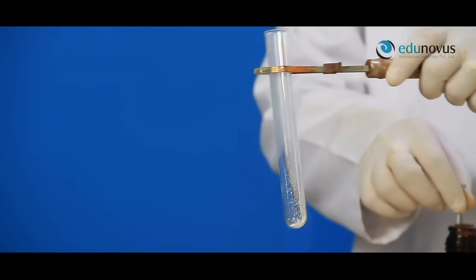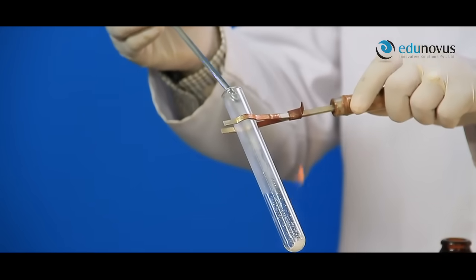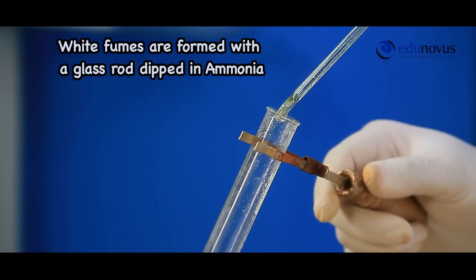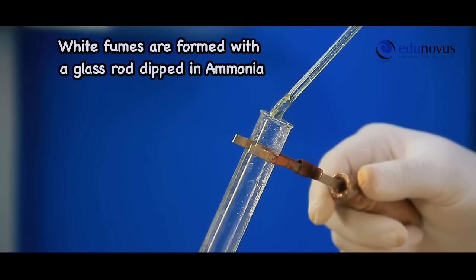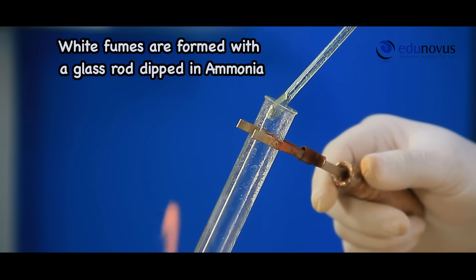If these vapors give white fumes with glass rod dipped in ammonia, this infers that the given salt may contain chloride anion.